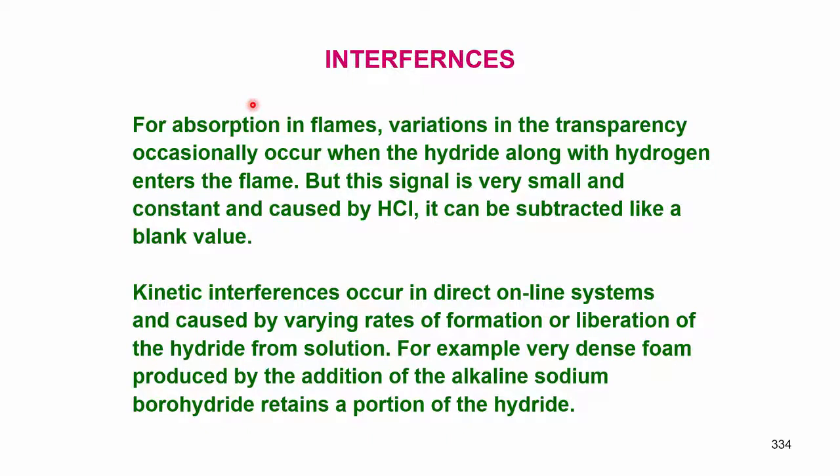This signal is very small. Which one? The hydrogen flame. When hydrogen enters the flame, there will be some transparency. That means it will burn without a red flame.